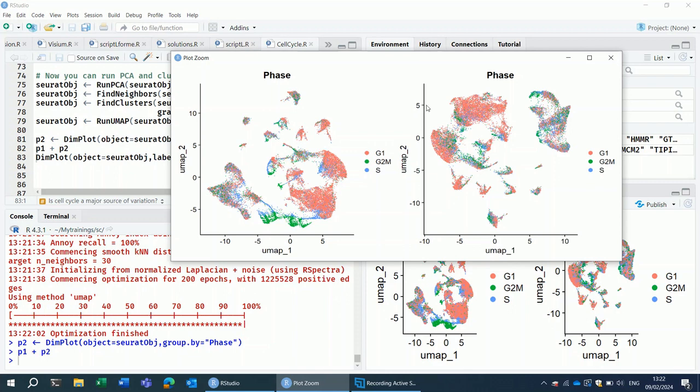So it is essentially the same UMAP, it has just rotated a bit. This happens because UMAP has a bit of randomness inside, so it doesn't always give exactly the same results. What you typically see is that when you do it multiple times on the same data set, you sometimes get results that are slightly rotated. So it's very much alike.